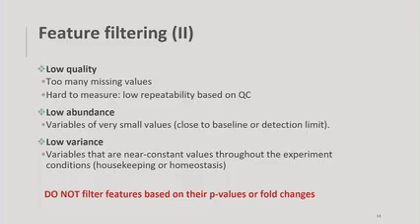These are highly unlikely to be related to our experimental metadata, and as long as we don't consider our class labels, like our treatment and control labels, and so we don't filter features based on some statistic that uses those, like fold change or p-value, we can do this without biasing our statistical inference. So if we're using these totally unbiased methods, just calculating the variance across all samples and then throwing features out based on that, that's okay.